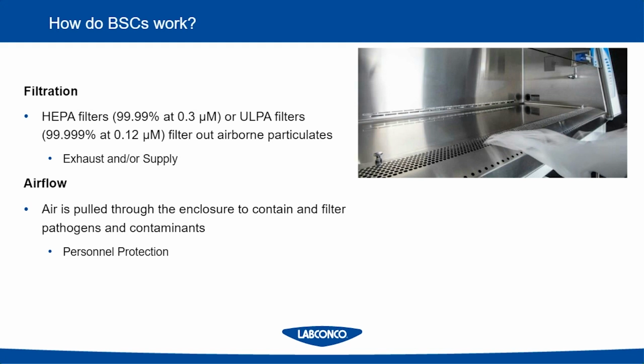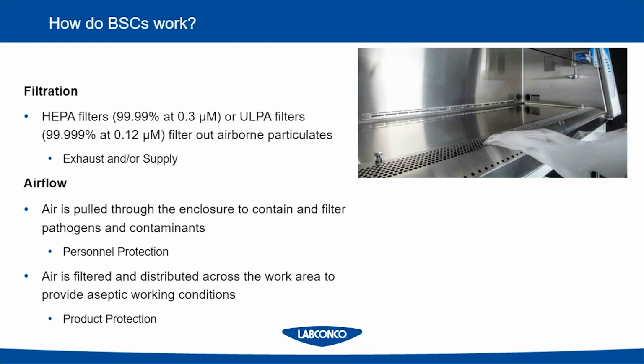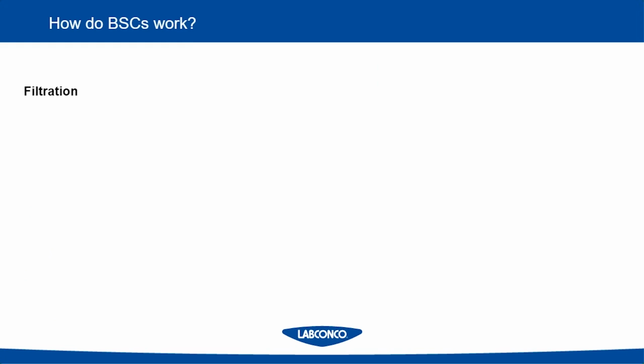In the image you now see to your right, you see a little bit of smoke being drawn into the front of the cabinet. This is just a picture of how this air is pulled in and then distributed under the work surface to stay away from the user.